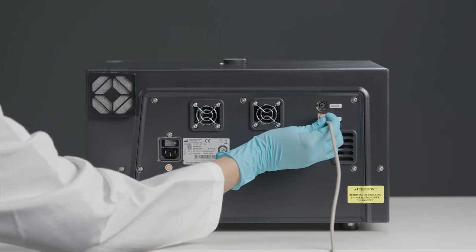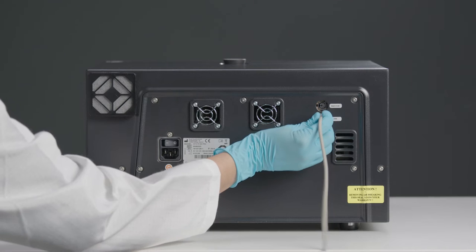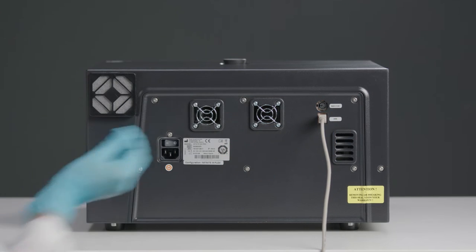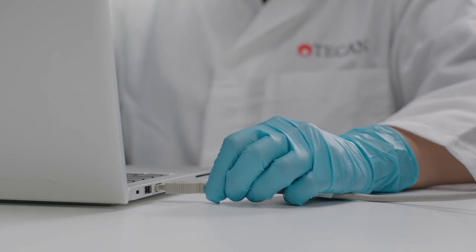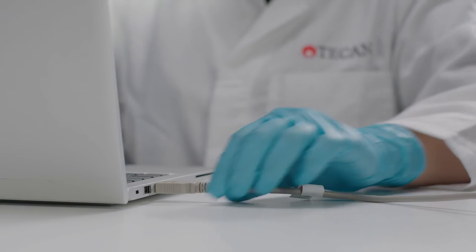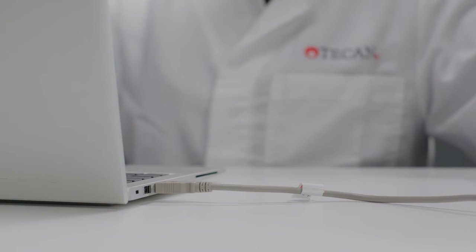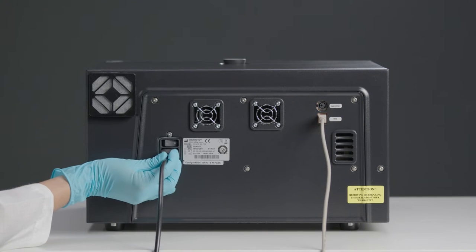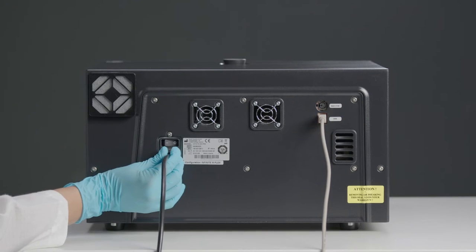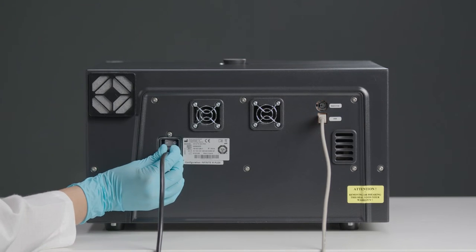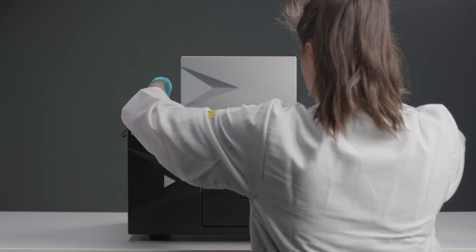To connect to your PC, take the USB cable and connect it to your device. The other end goes into your PC and then connect the power cable.